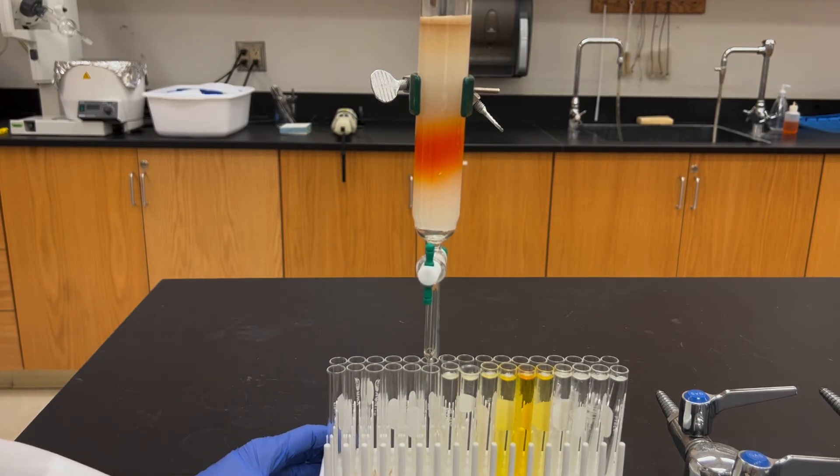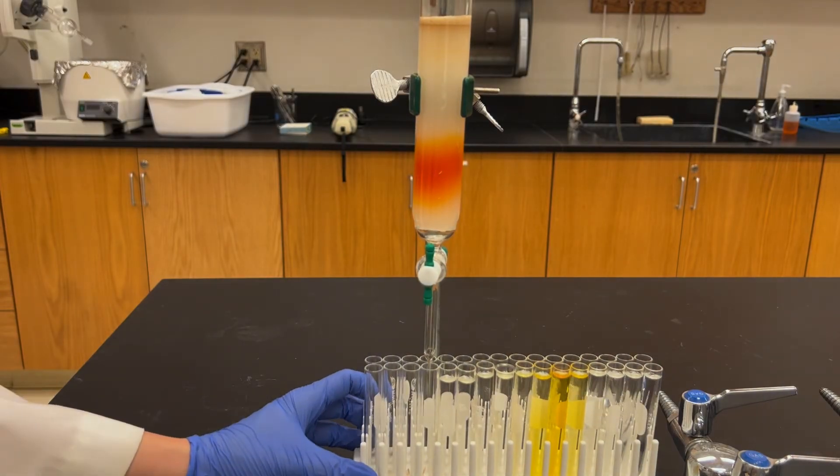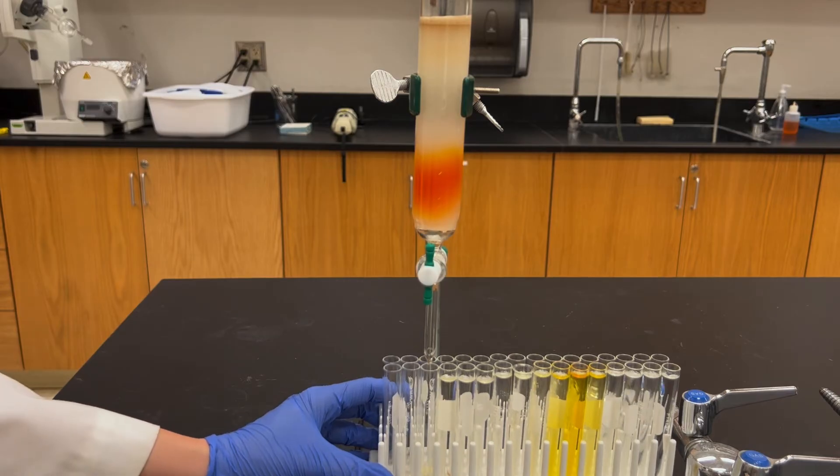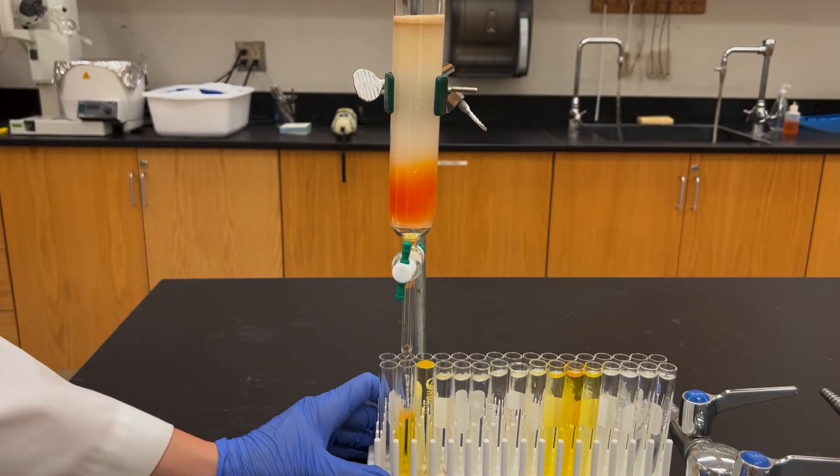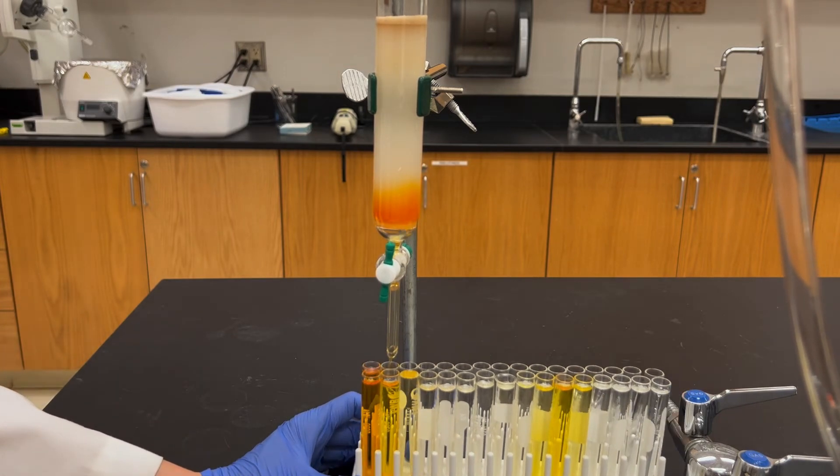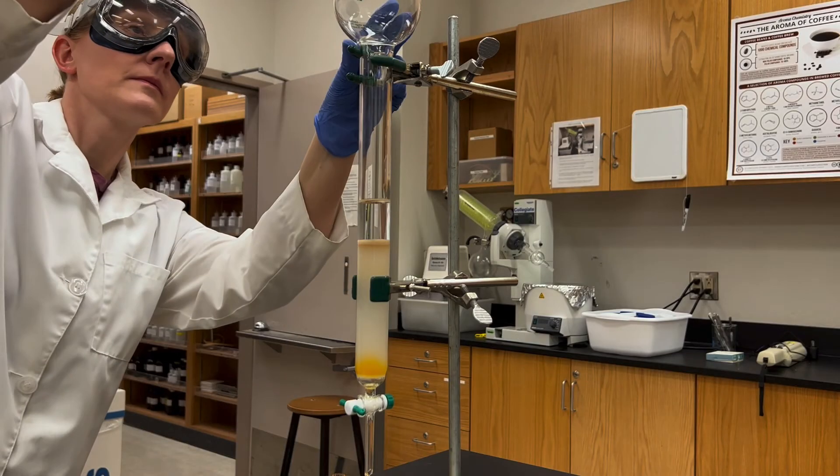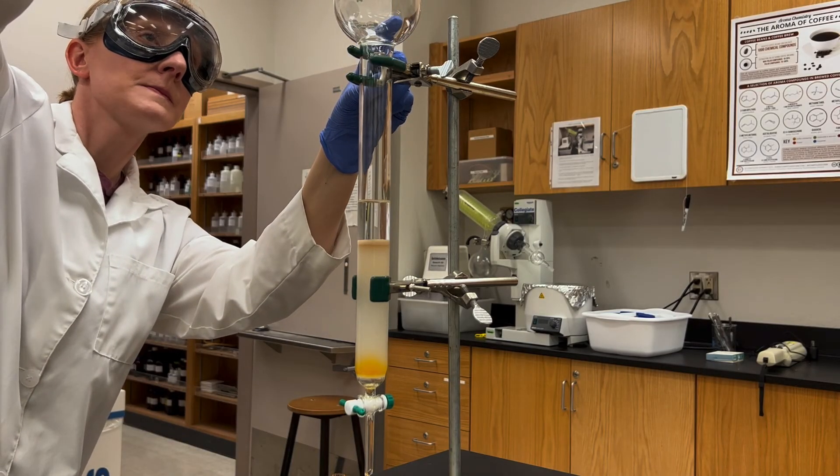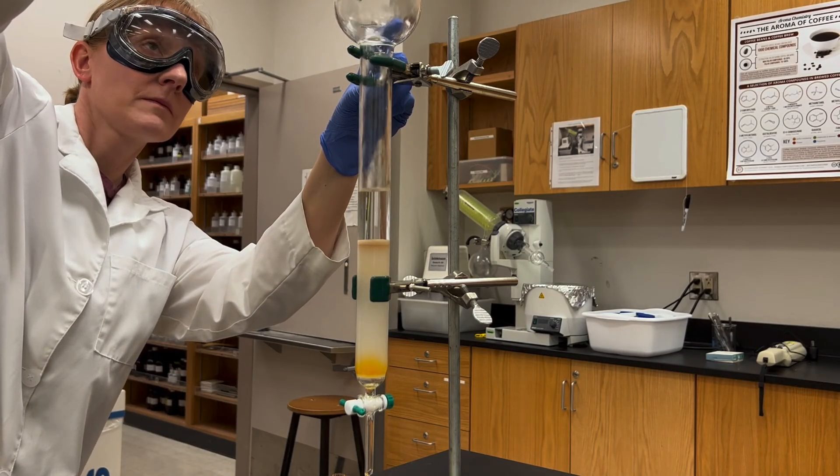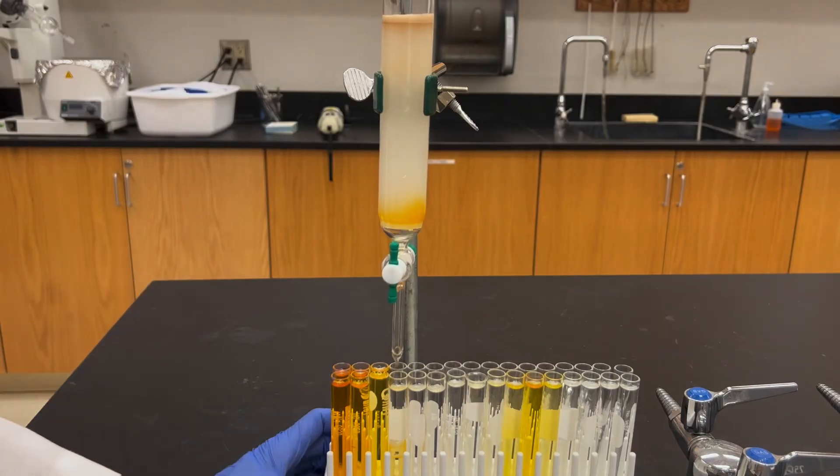I'm going to just keep collecting fractions until my orange compound has also eluted off the column. Do make sure while you're doing this to keep your eye up on the solvent level. You don't ever want the liquid level to travel lower than the sand level. You need that silica gel area to always be wet. So if it is getting a little too low, do pause the process, close the stopcock and refill the solvent reservoir, and then continue with the column.